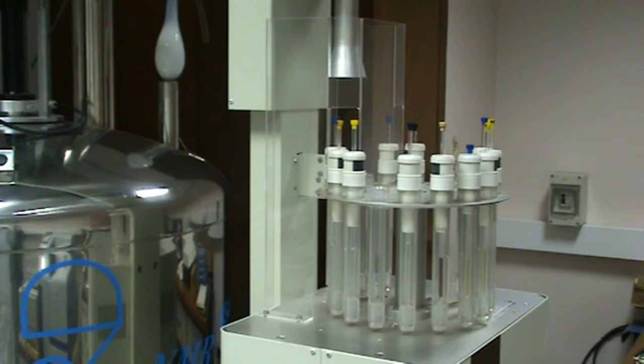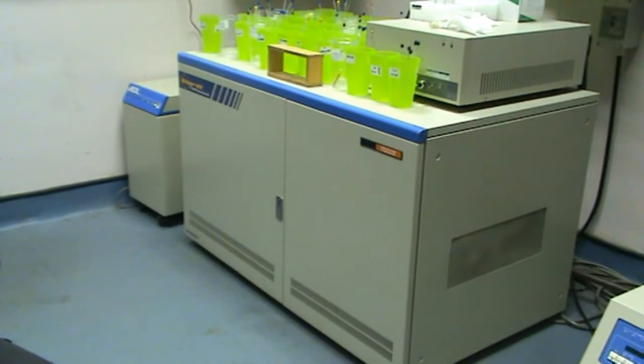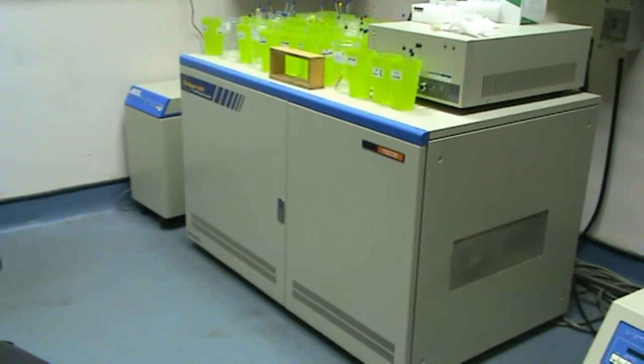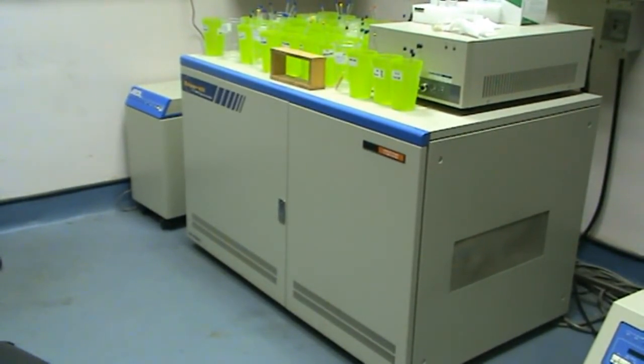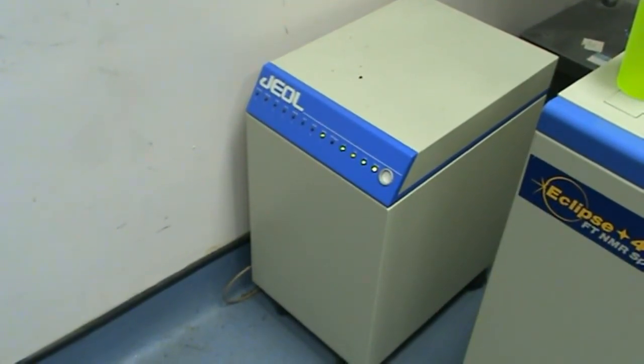The NMR has a carousel in which the samples are placed to be analysed. The main console generates and receives the frequencies used in the NMR probe. To the left of the console is the data acquisition unit, which processes the data received and communicates this to the PC.